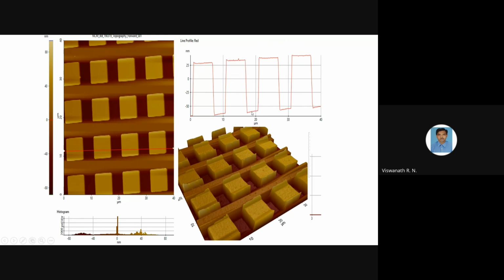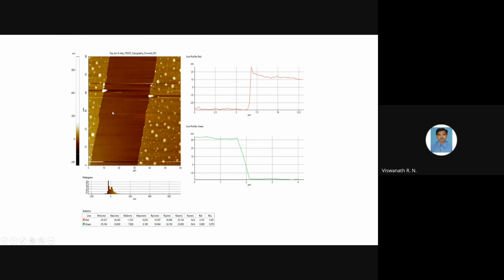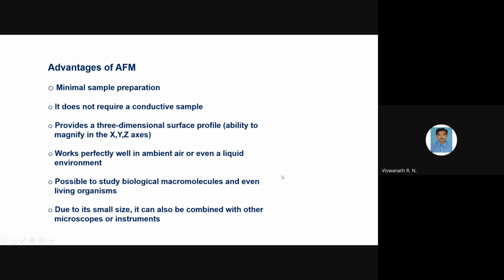The quality of the image can all be recorded, including the width of the structure. If I have another, smaller structure with a separation, this separation is measured, and these oscillations are related to this structure. If you want more, you have to zoom into this region. Similarly for the other sides. So this is the way the AFM technique is used.